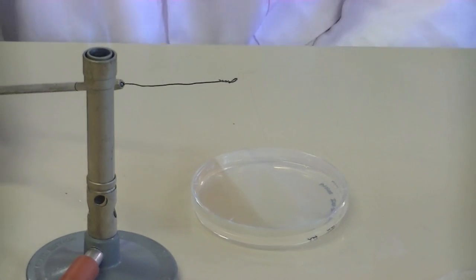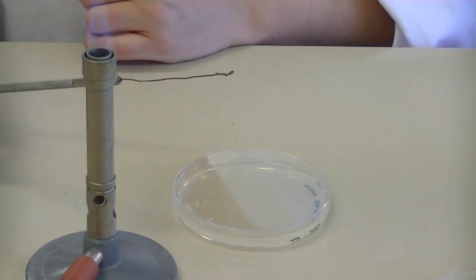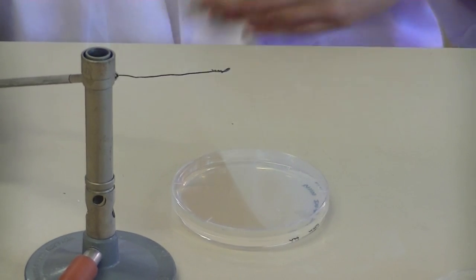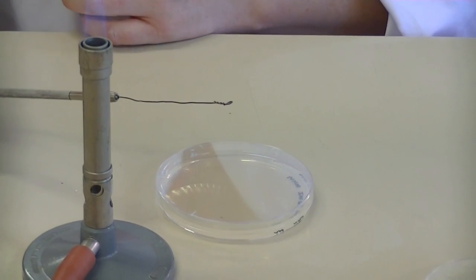If you feel uncomfortable when streaking, you can actually draw the streak lines as per your diagram onto the bottom of the plate. For this demonstration, I'm not going to do that because it will obstruct the view.